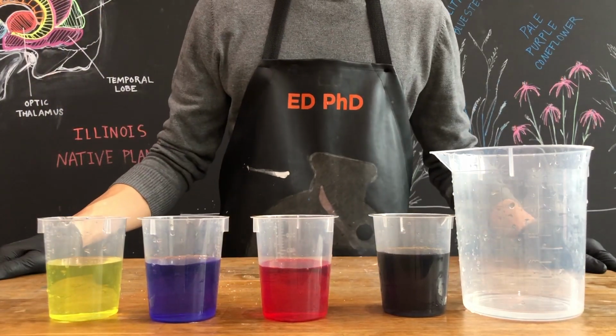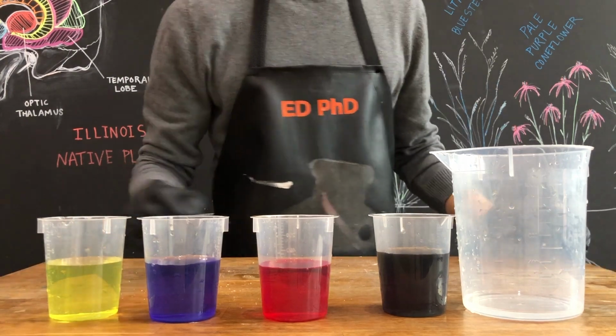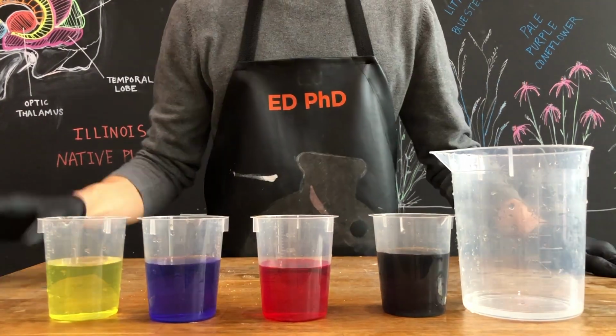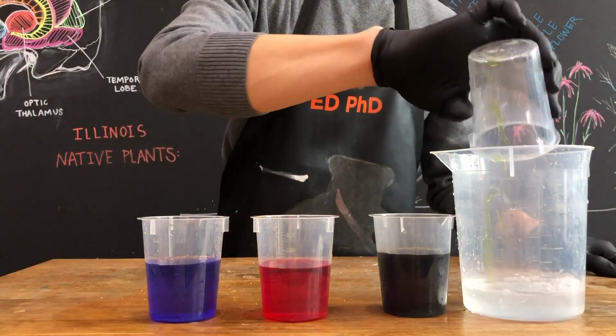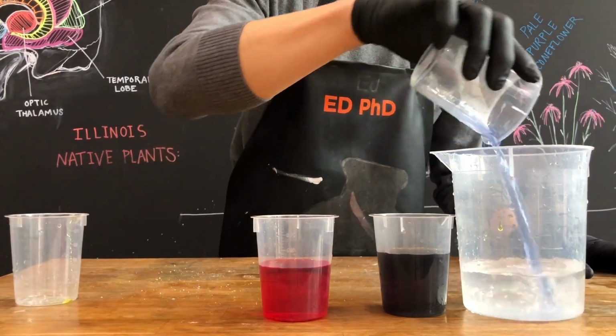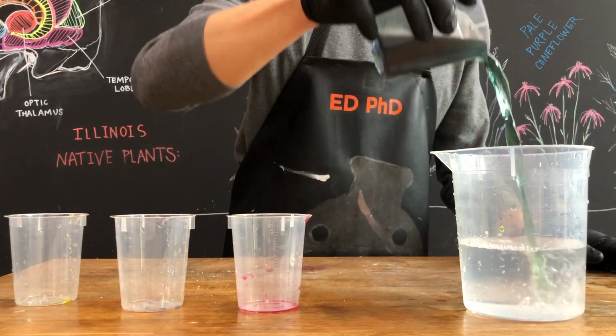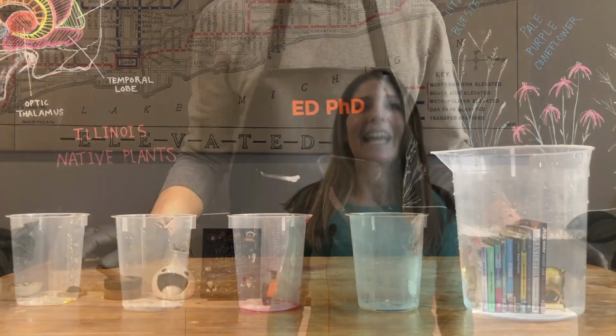By adding our basic solution, potassium hydroxide in this case, we see the beakers fill up with the different colors using the same colorless liquid. Then each colored beaker was poured into an acidic solution, in this case a hydrochloric acid solution, and this made the colors disappear. This is how we sort at our wizarding school here in Chicago at the Laboratory Collective.